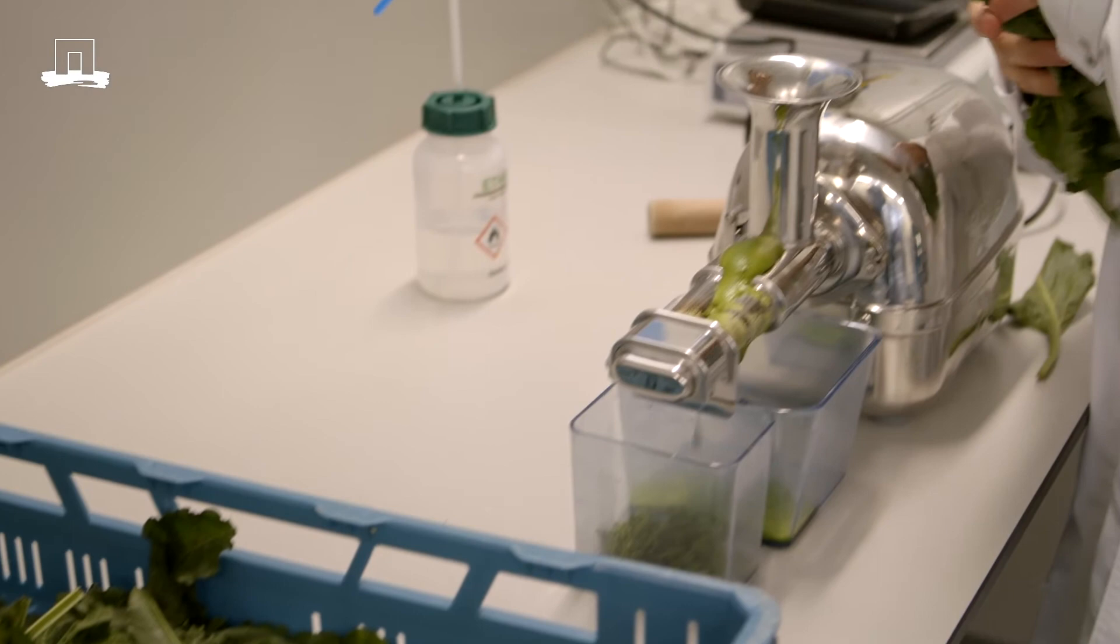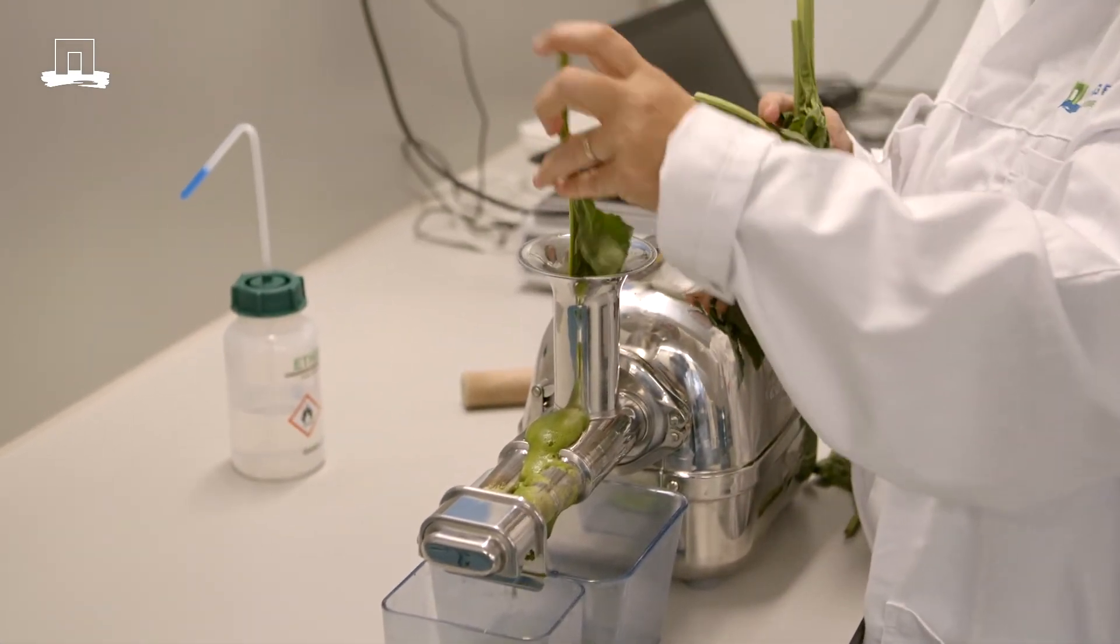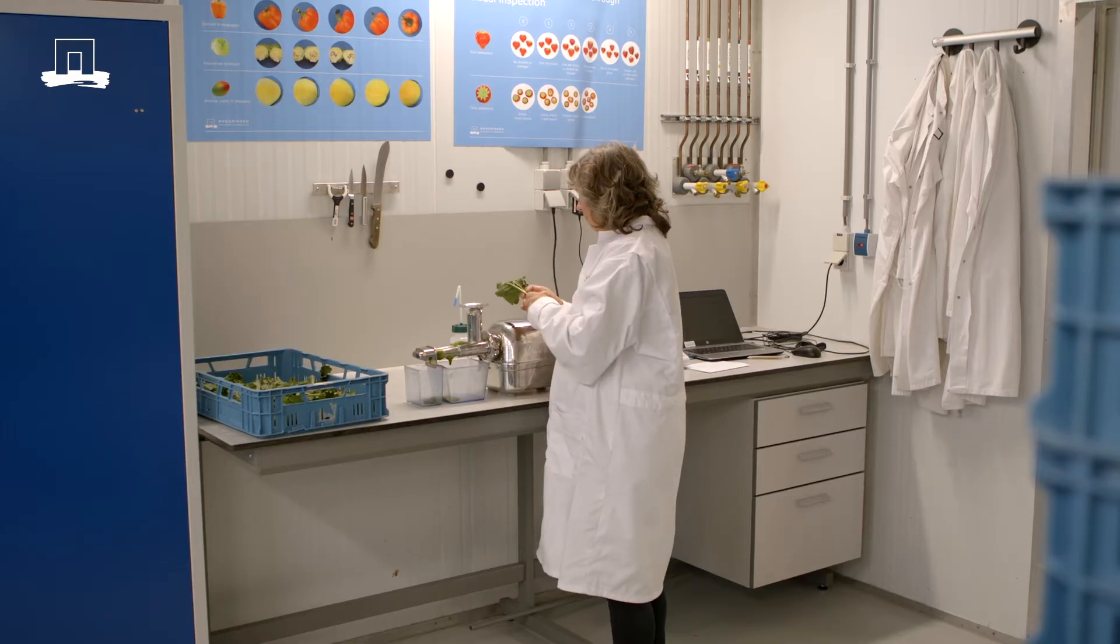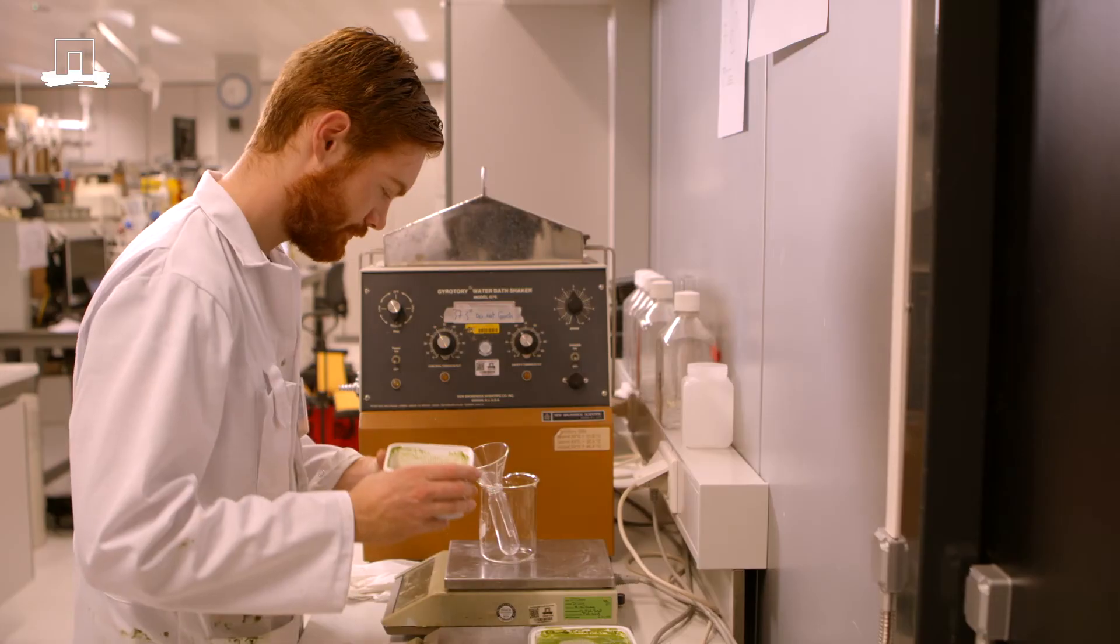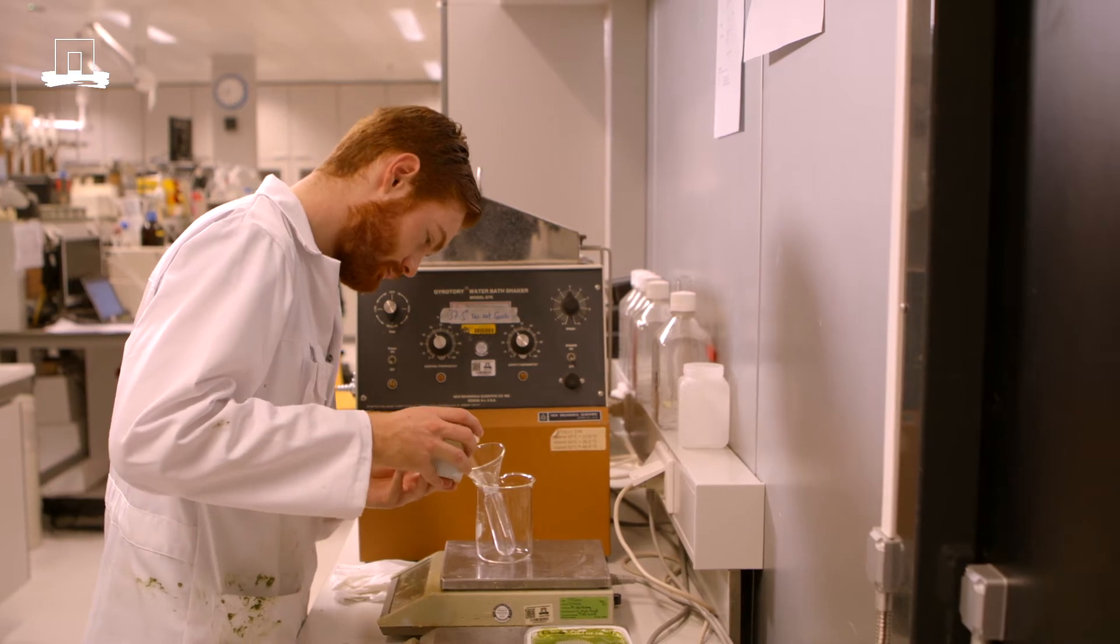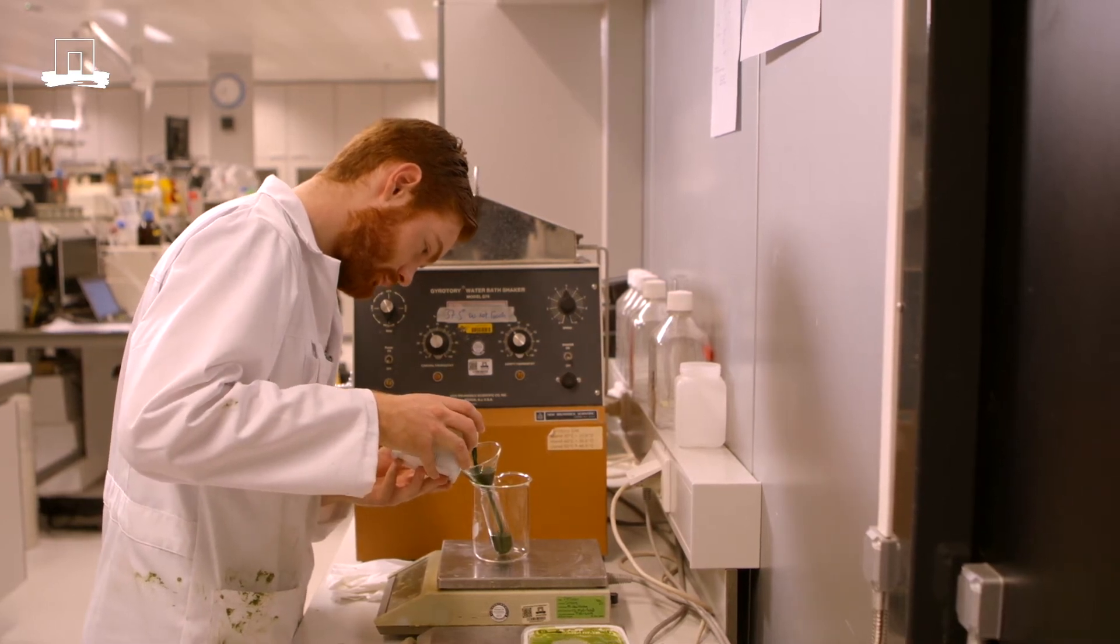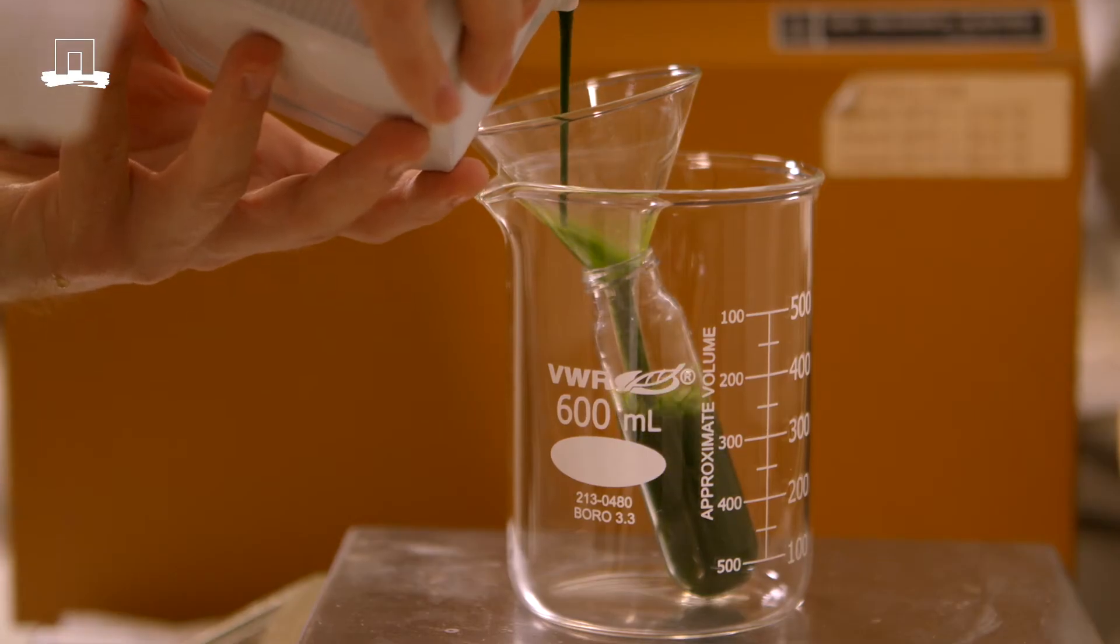To see how successful the proteins can be extracted after storage under different conditions, we press the material and collect the juice. We measure the amount and draw up a mass balance. The juice, containing also the Rubisco protein, will be analysed on protein content.